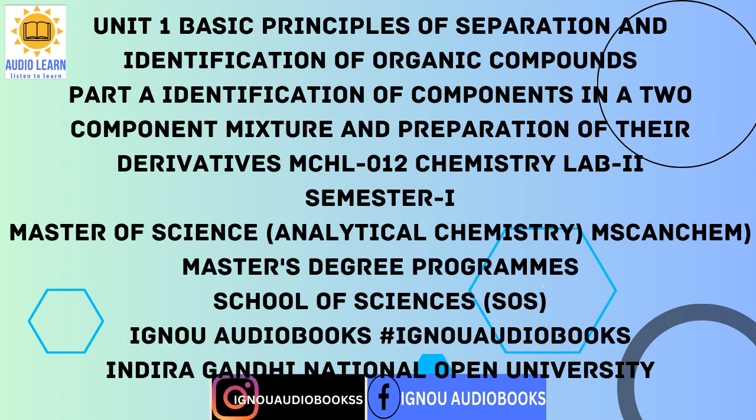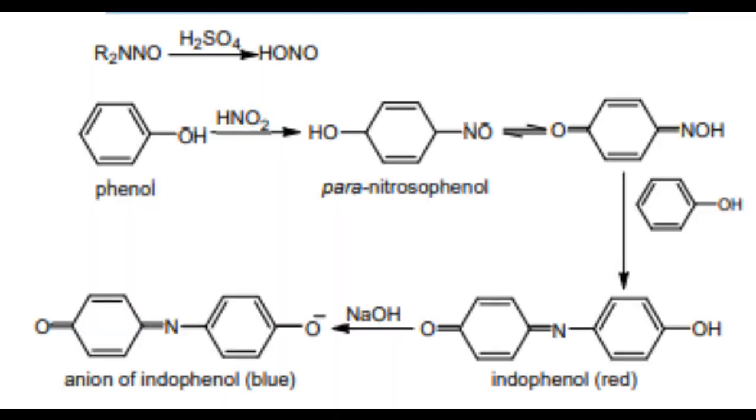To dispose of the isocyanides so formed, add conc. HCl to the test tube and leave for about 10 minutes without disturbing. Then, discard the contents of the test tube to the sink and flush with water. The secondary amine on reaction with HNO2 forms N-nitrosamine. The nitrous acid HNO2 is formed by the reaction of sodium nitrite with concentrated sulfuric acid.